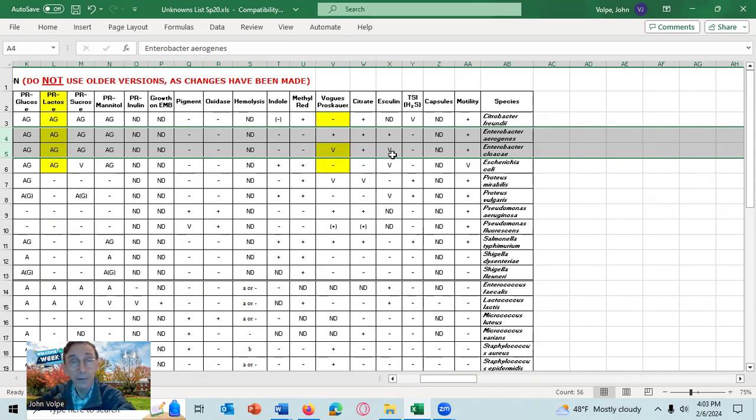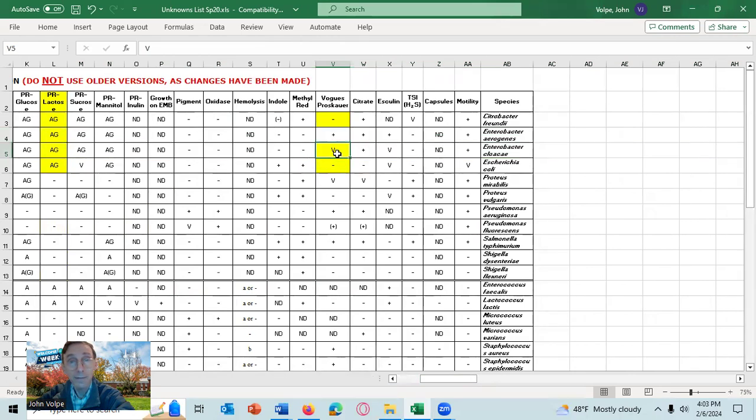And I will help you a little bit, but you have to find a variable that separates these two species. And what you'll do is you'll just keep doing the tests. Whenever you get a negative, it has to be this one, because that one's not going to be a negative. Or you get this one, it's a negative. But if this is a positive, you haven't separated those two. So you'll run that test and hopefully it'll be a negative.